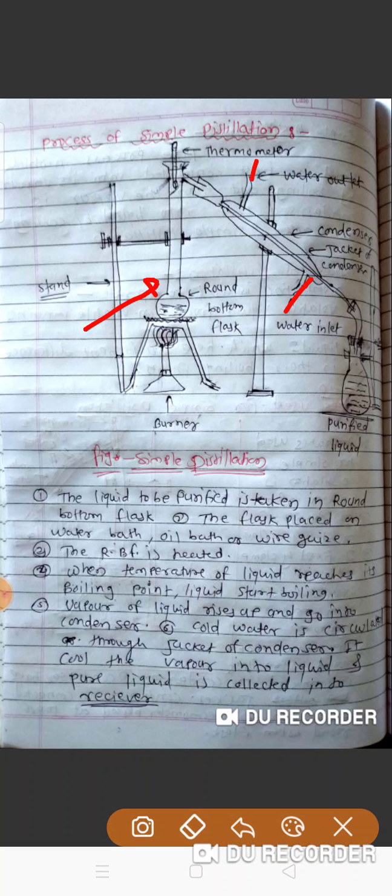When the round bottom flask is placed on the oil bath or water bath and heated, the temperature of the liquid rises and it starts to boil. The vapor enters the condenser, and due to the cold water circulated through the jacket, it converts back into liquid, and that liquid is the pure liquid. Pure liquid is collected in the receiver. Here is the receiver. Okay, I hope you have understood.